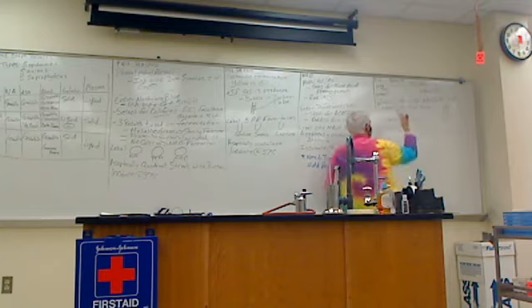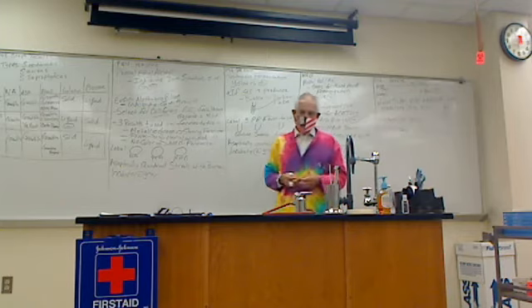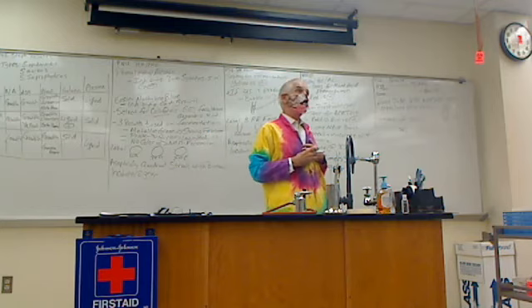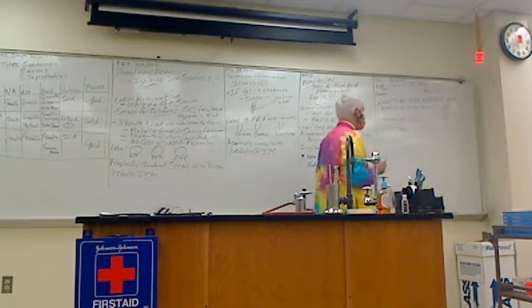And then our last one, guys, is also on that same page, and that's the phenylalanine deaminase. So what happens, guys, is how many of you have heard of phenylalanine? It happens to be an amino acid. Any of you ever heard of PKU? Okay, that has phenylalanine in it.